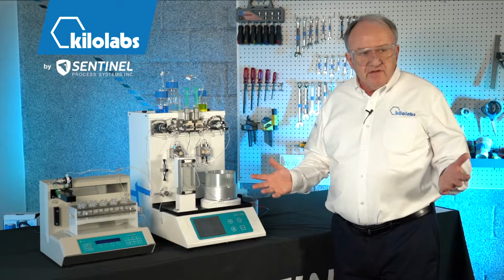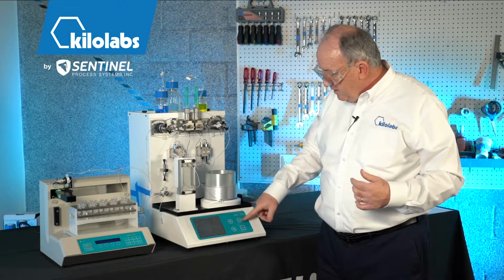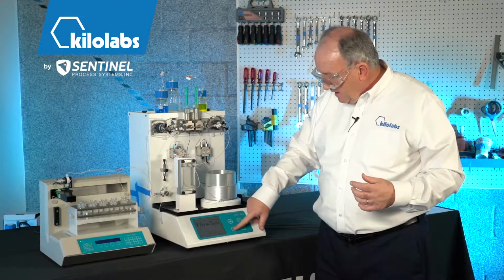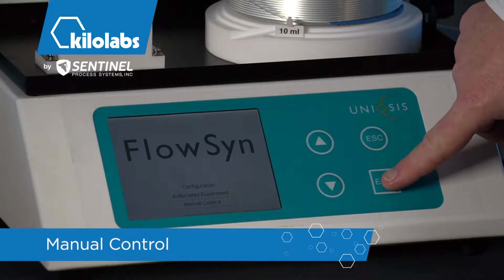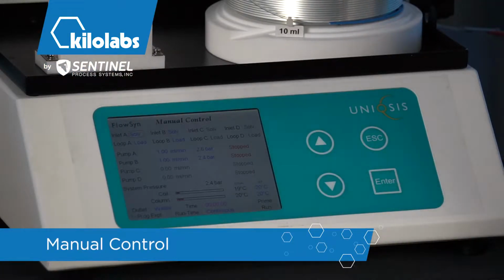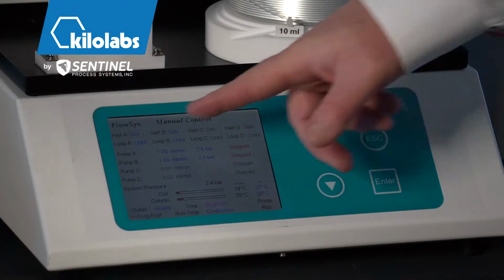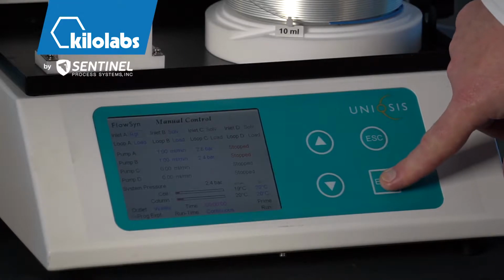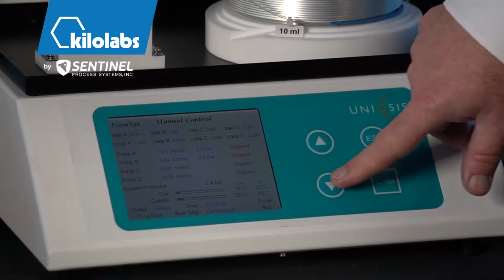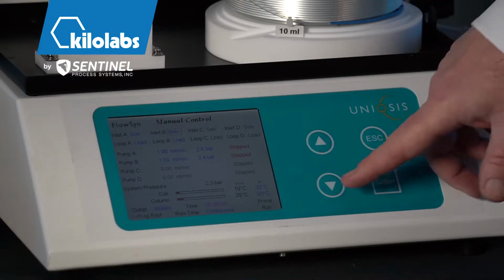So now we've configured the system. In configuring the system, the system knows what's connected to it, and it knows how to carry on, if you will. The next screen is manual control. The manual control is in essence to allow you to take a look and make sure that you set things up properly and that it's also running properly. And you can change the selection of the inlet valves to solvent or reagent. You can hear them click as I switch those. And also for the B pump as well, there's an A and a B pump here.